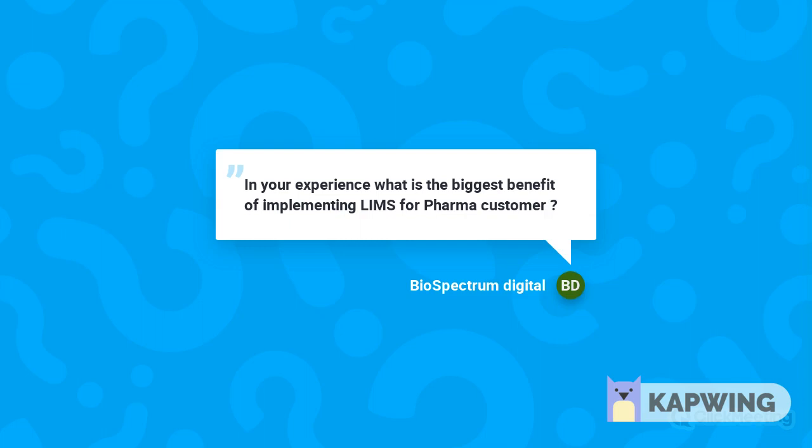So, as an analyst personally, and that's my background, I know my favorite part of LIMS was the fact I didn't have to perform calculations anymore, and the instrument interfacing made it so much quicker for work to be done. But if we're thinking along the lines of a business as a whole, I don't think you can look past the importance of compliance.